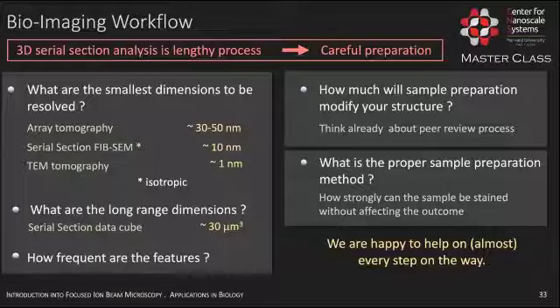So this happened in the case of Rachel's work, but Rachel and Jeff were looking ahead and had already these things in mind, and could respond to the queries from the reviewers. And then, of course, if you want to make your life easy at the end, we haven't talked about segmentation, that is its own beast, but you want to get as strong data as possible. So there are techniques to enhance the contrast, but then one again has to ask, are these techniques in any way changing the behavior of your material?